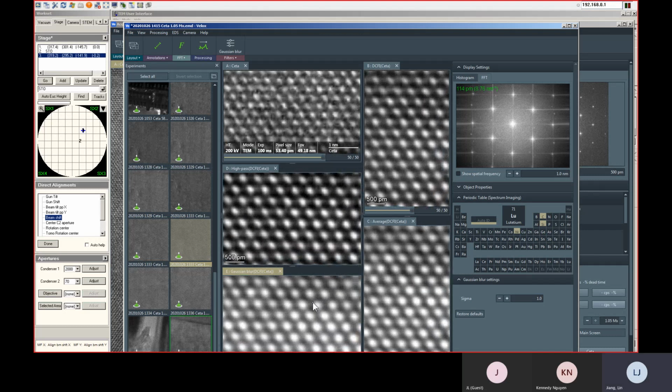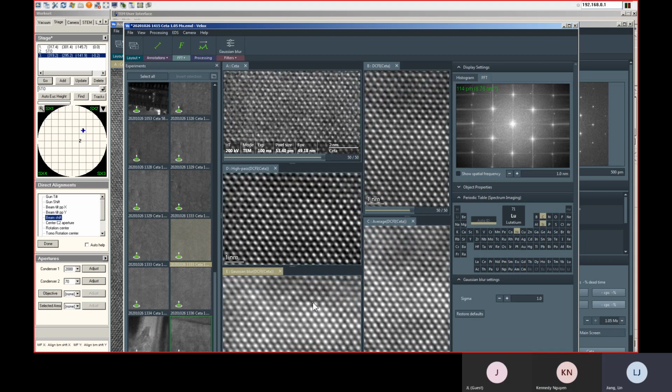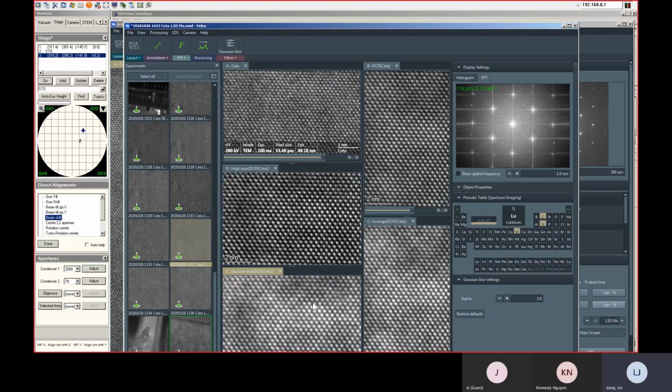So basically, with the Gaussian filtering, the central piece is first going to count the intensity from the kernel, like if you are 3x3 or 5x5.